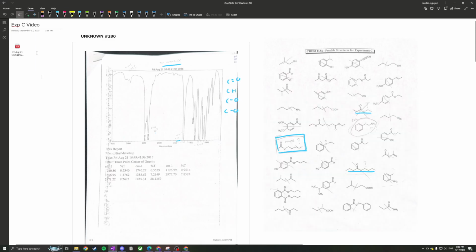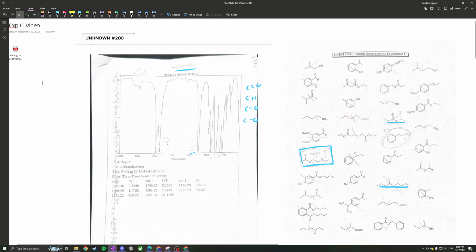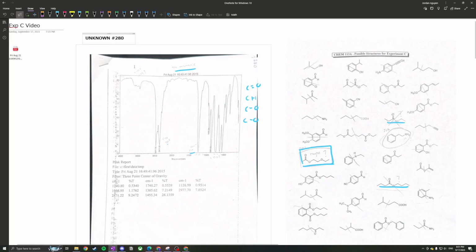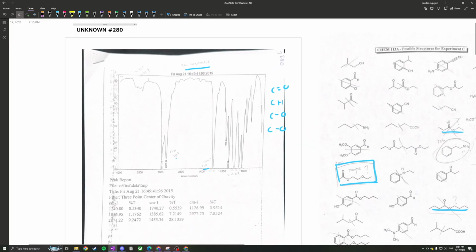This is my experiment C video. So I had unknown numbers 280 and 206. First I'll go over my unknown 280 and how I determined its compound.